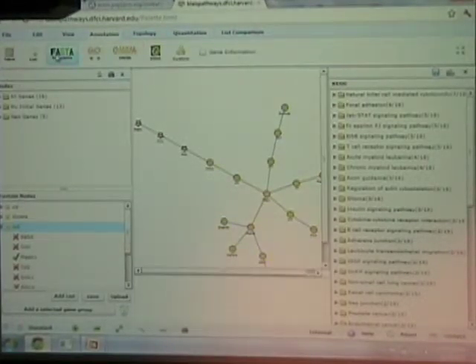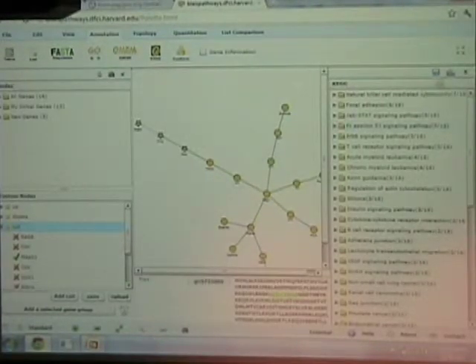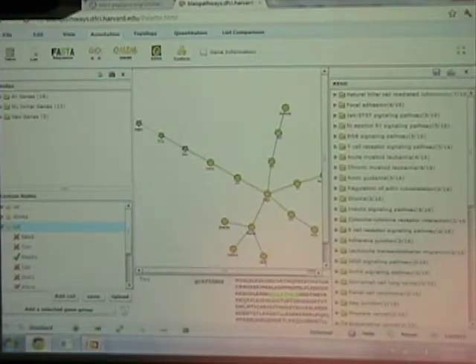One of the things that you can do, first of all, is look at the underlying sequence. And the window is kind of busy, but I happen to know there's only one phosphopeptide detected for this protein, which is this one. And you can see it makes sense that there's tyrosines here because we've enriched for phosphotyrosines.